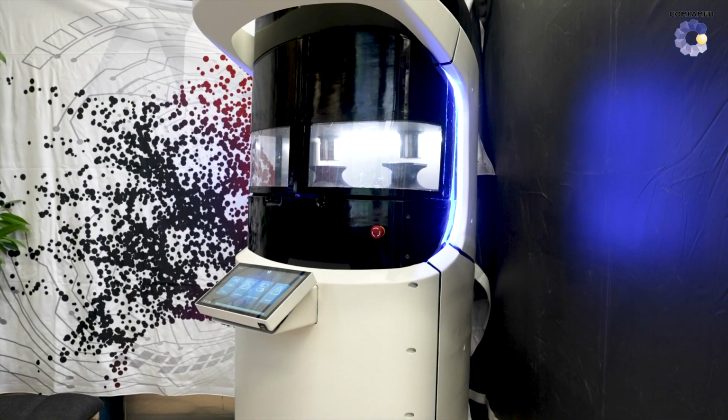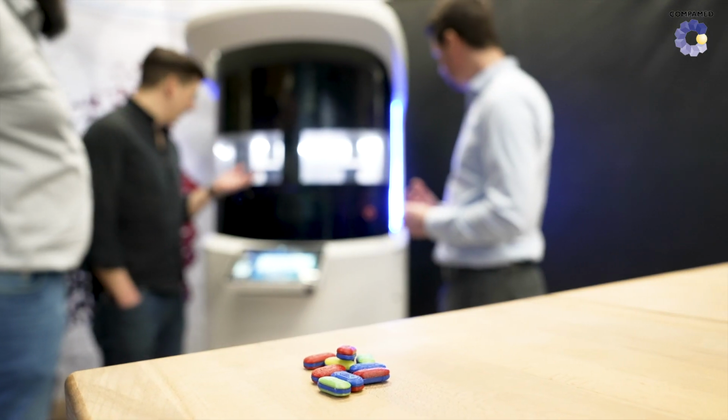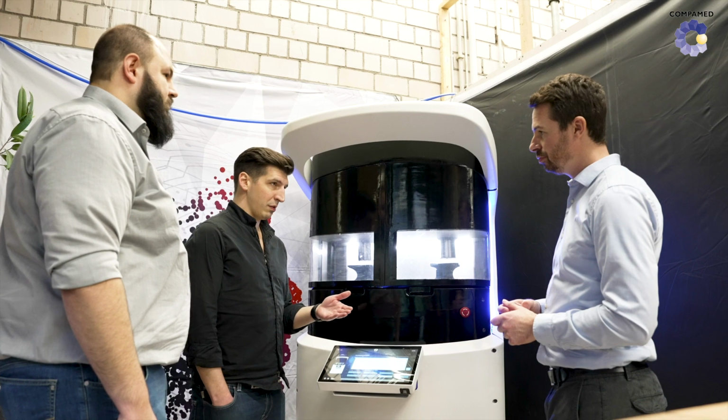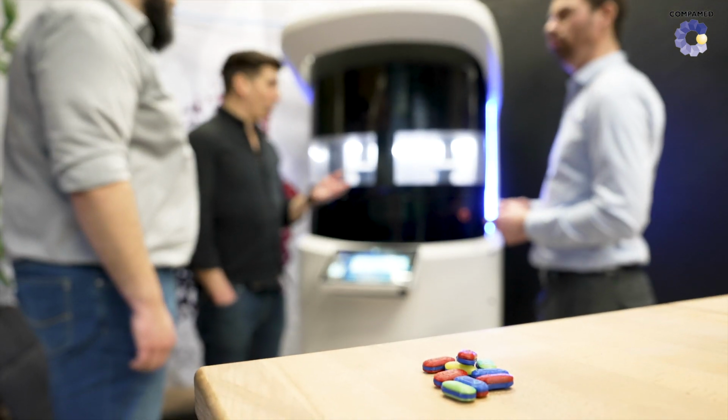Cologne has developed a 3D printer. It can process polymer drug filaments for the individual dosing of drugs. Experts from engineering, pharmacy, and polymer development join forces to achieve this. Their aim is to tailor drug therapies more precisely to people.